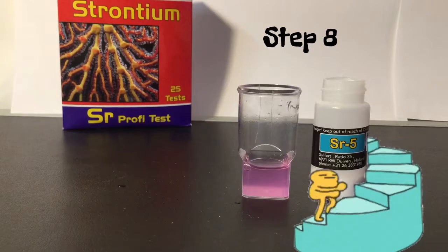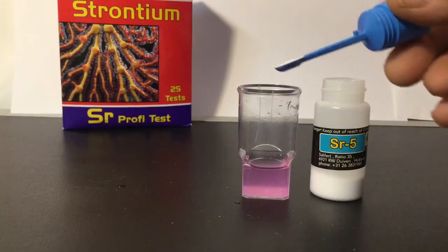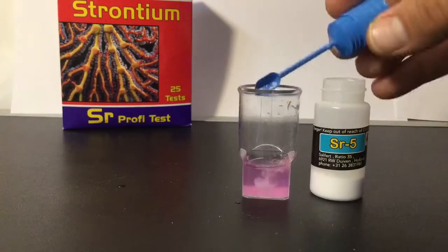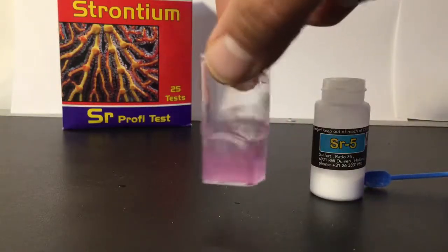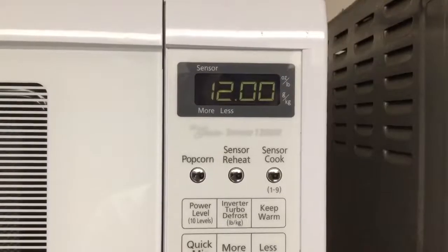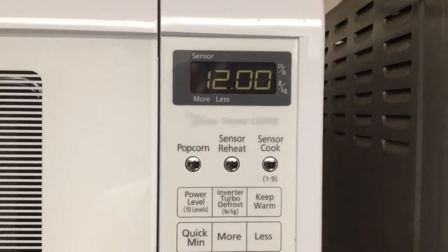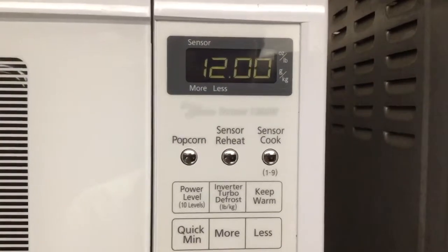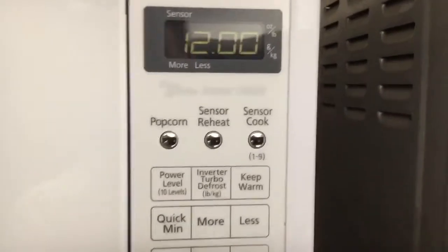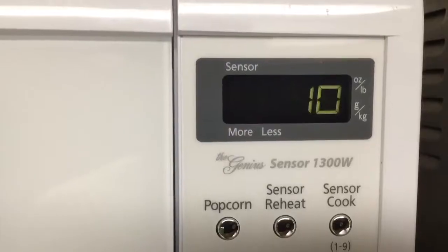The next step is to add one level scoop of the SR5 powder to the test vial. Put that right in there and then swirl it until it's dissolved. Once the powder is dissolved, you want to let it sit for 12 to 15 minutes. I've only got 12 minutes on the timer.